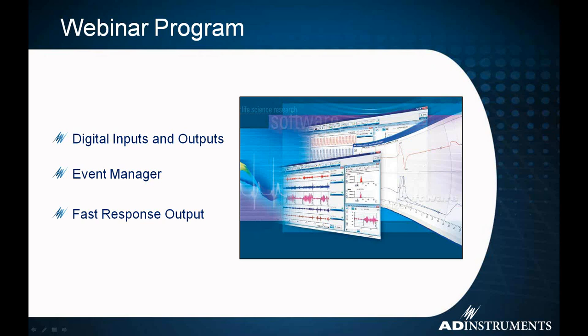And today, this is our webinar program. First, we're going to cover digital inputs and outputs. Like I said, these are built into LabChart. There's no additional plug-in that needs to be added. Next is Event Manager. This is an extension, so it's free to anybody who owns LabChart, but it is something you'll have to download and install. And then Fast Response Output. That is also an extension. It's free to anybody who's purchased LabChart, but you will, once again, have to download and install it.